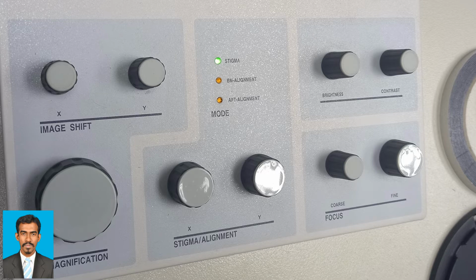Image shift X and Y is to move the sample plate in either the X or Y direction. We have already seen there are around 15 plateaus, any one of which can be focused. So through this X and Y we can move it, or through the joystick also we can move it in either the X or Y direction. Range of movement in X direction 0 to 100 mm, Y direction 0 to 50 mm, Z direction 5 to 65 mm, rotation 360 degrees continuously, and tilt minus 20 to 90 degrees.